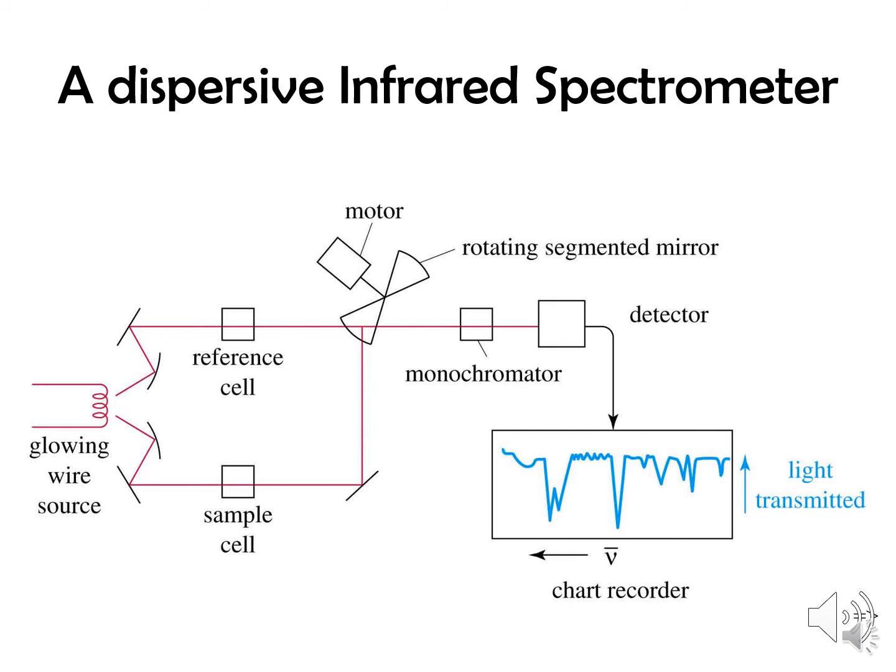Okay, different kinds of spectrometers. The dispersive, 30 or 40 years ago, this was very common. You had a reference beam and a sample beam. You had a chopper, a monochromator, and you would scan through this and take the infrared spectrum very, very slowly. The more slowly you did it, the better the spectrum you got.